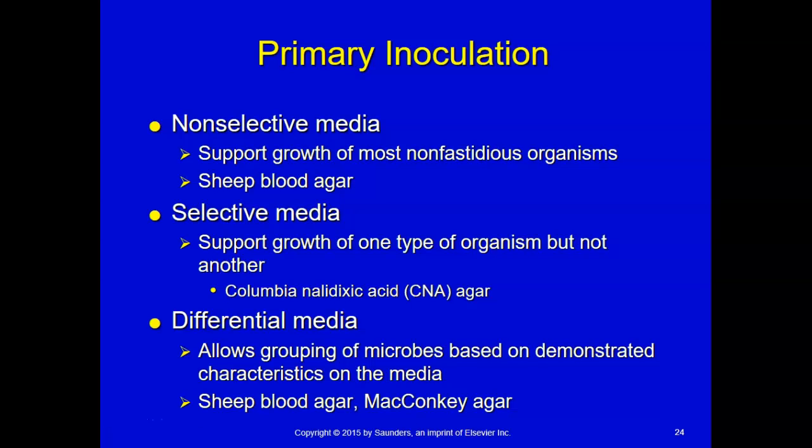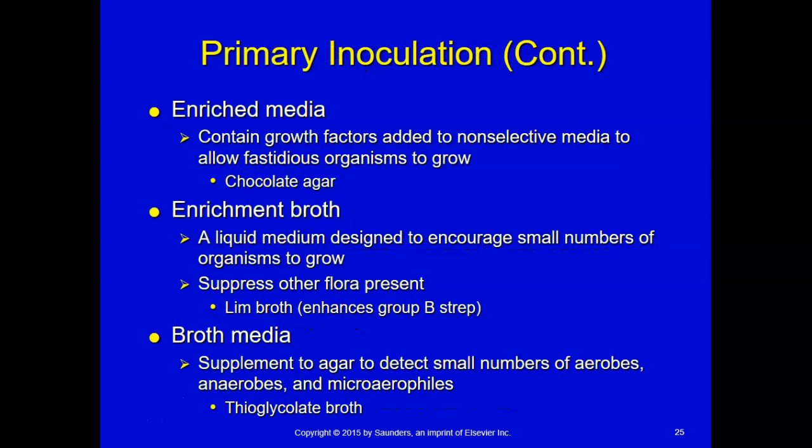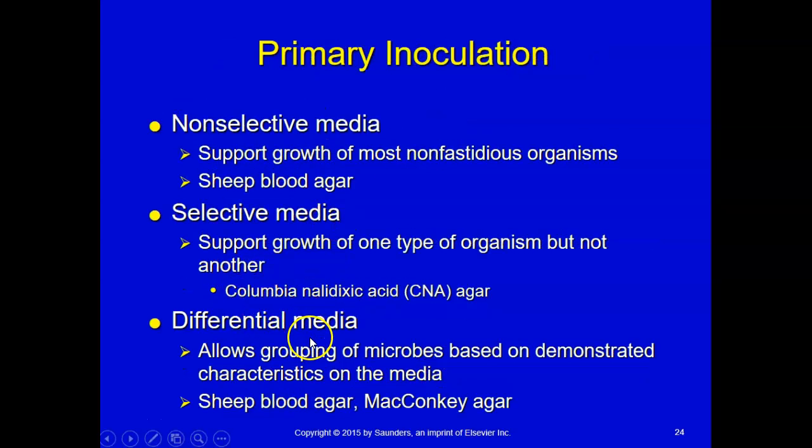Okay, we are also going to be responsible for selecting media for these different sites. So we talked about media selection and the different types of media in Chapter 1 at the beginning of this Pathogenic Micro 2 course. The different media are geared toward picking up certain types of bacteria. For example, we talked about how MacConkey is a differential agar, and it is going to grow gram-negative rods. And then there's another agar called CNA, or Columbia nalidixic acid, and that is going to be for gram-positive organisms.